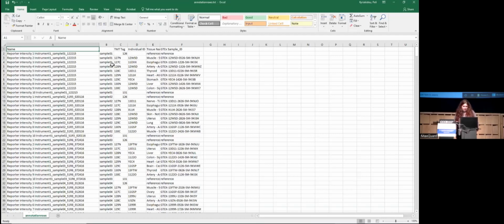And you see already that, for example, this second one is exactly the one that I showed you in the slides. So with Excel, you can do this as you prefer. You can add as many annotations as you want. For today, it's already prepared for you. So first, let's close it, because you have to close it, otherwise Perseus will not open. It's open with another program, so you have to save and close it.